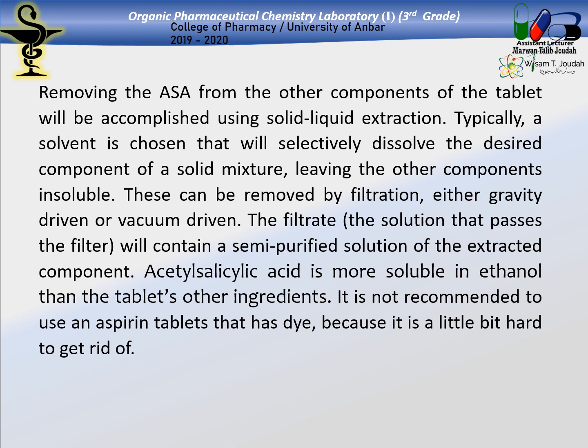احنا قلنا السوليد ليكويد وعندنا liquid liquid. The solid liquid لازم جزء من المكونات يكون soluble والجزء الاخر يكون insoluble. This can be removed by filtration, either gravity driven or vacuum driven، اللي هي يا اما بالفاكيوم او الاعتياديه. الفلتريشن تعرفوه يعني we know everything about filtration and we know how to do a filtration for any mixture.